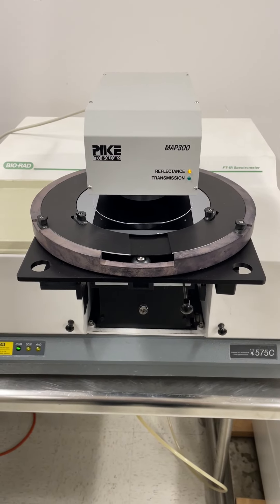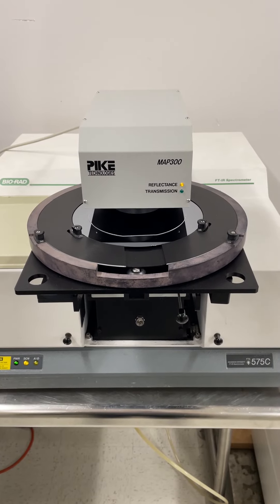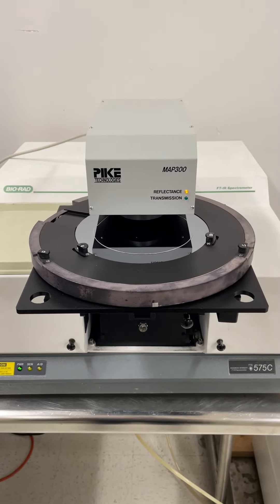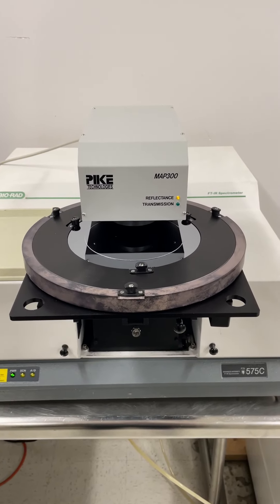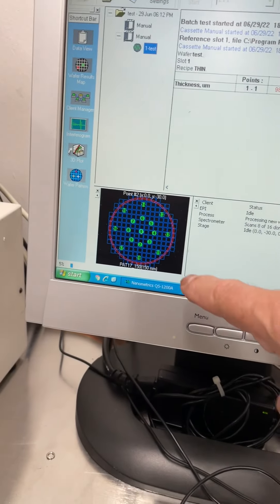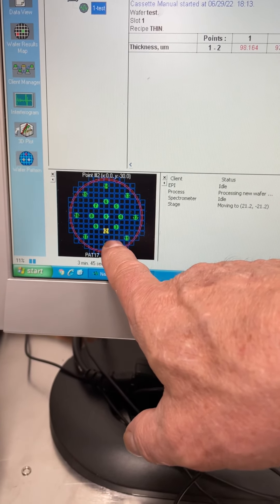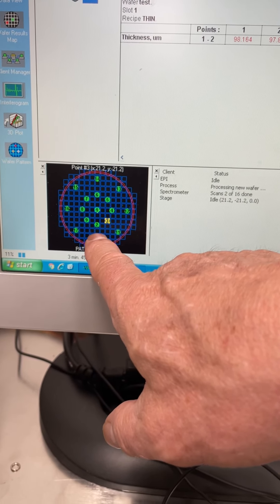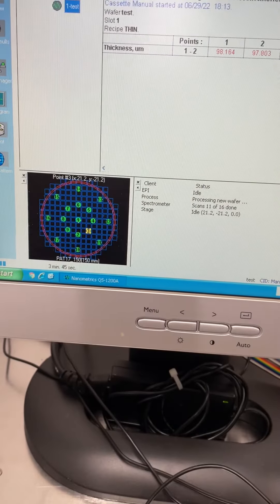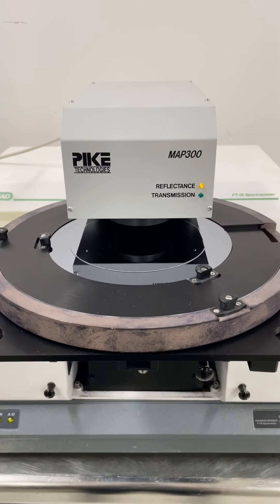It's running the first point in the center. You can see the scan light going, so now it goes to the center — we call it the middle ring. It shows on the GUI what position it's analyzing, so it's just in the center at 6 o'clock, and now we're going to go around the outside. It might go back in another direction before it makes the full revolution.